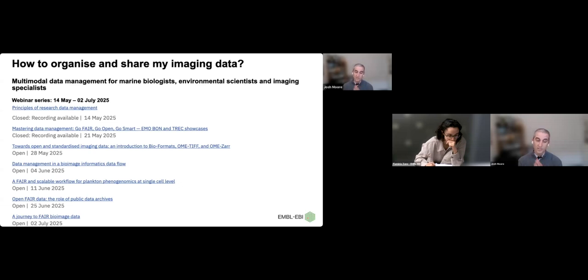your proprietary file formats completely to OME-TIFF and OME-Zarr. And that's going to take investigation and looking at what comes out and making sure that you can do the things you want to do. So A, the downstream analysis, but then also B, getting back to Tina's question of taking the converted data and taking it back to the microscope, loading it and going, oh yes, it looks exactly like the original file format did. So that's going to take many of us experimenting with this. But it is what needs to happen if we're going to move towards a common format.